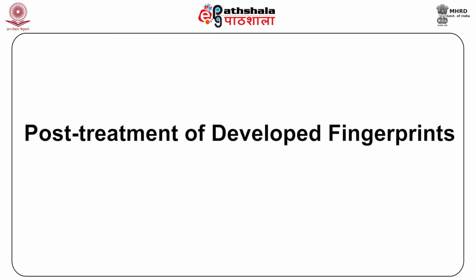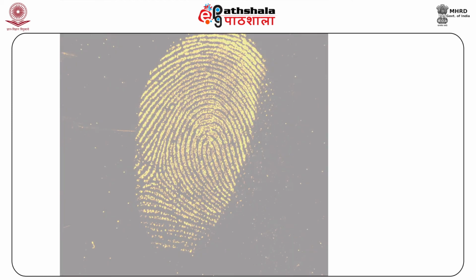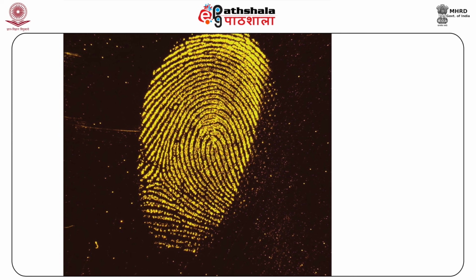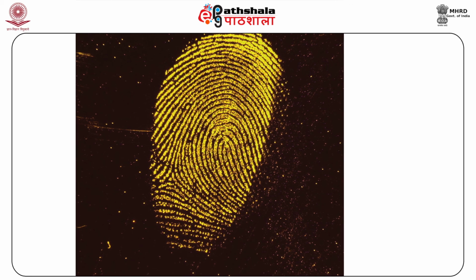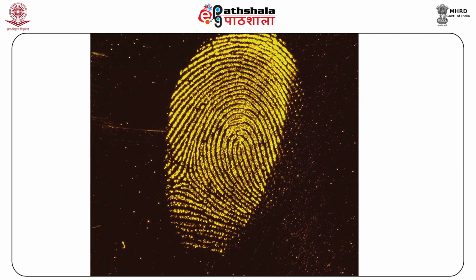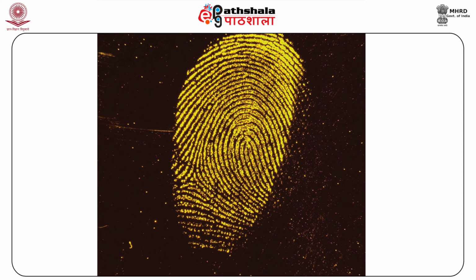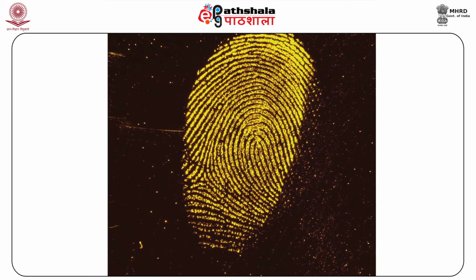Now, let us have a look at post-treatment of developed fingerprints with luminescent materials. In this procedure, the finger impression is treated with a laser active substance which becomes physically adsorbed on the sweat residue. When illuminated with laser light, the ridge pattern produces a contrast via the background.